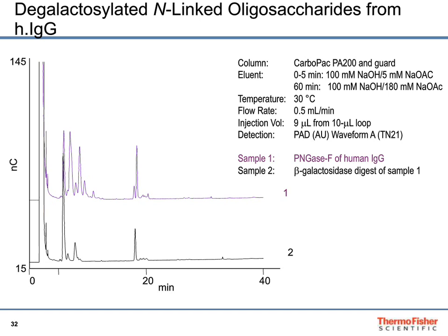So that region that was in the 10-minute region there, we see a lot of those structures, remember, have either 2 galactoses, terminal sugars, or 1 galactose. Well, since all the galactose is now gone, we've put that into that 1 major peak, but it also shows us we have some other things there that don't terminate in galactose, or if they terminate in galactose, have some other thing, perhaps a bisecting N-acetylglucosamine. We also may have some high mannose structures which wouldn't be affected, like the MAN5, where we have 5 mannoses.